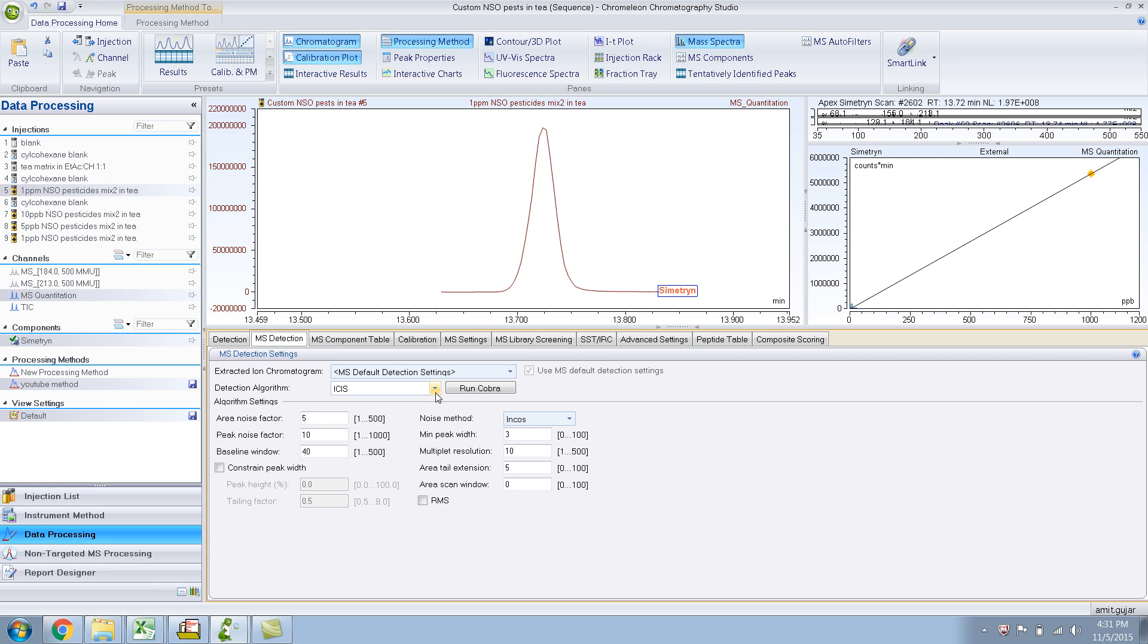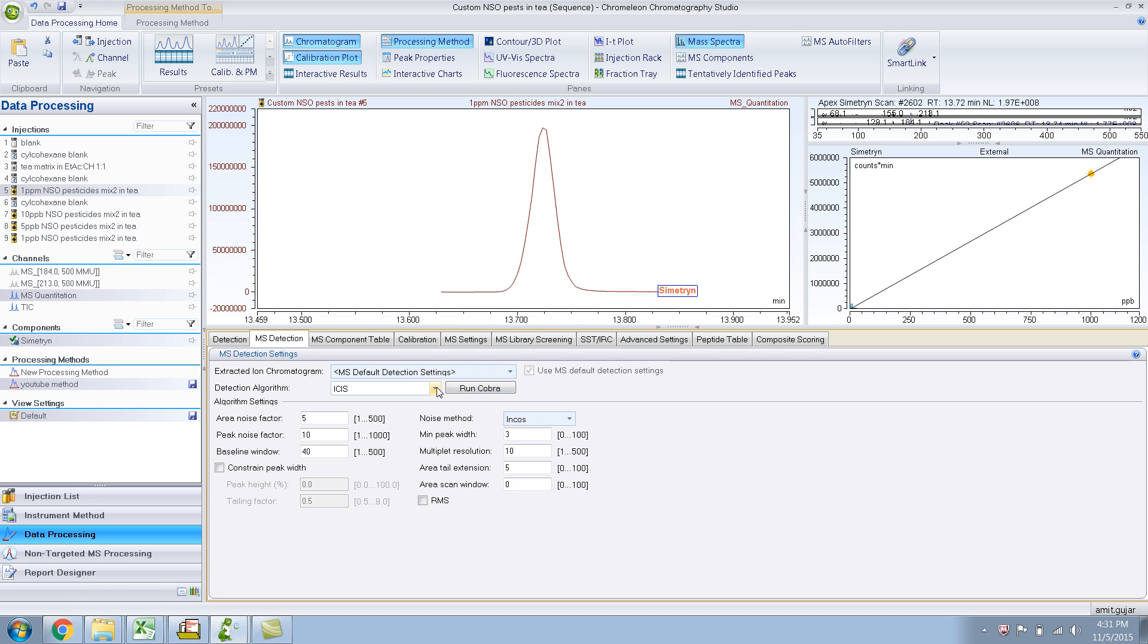ISIS is what I generally use, but you can very well use Cobra or Genesis. Extracted ion chromatogram, MS default settings.